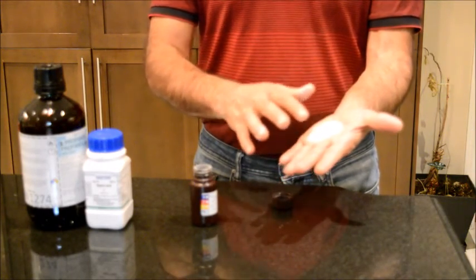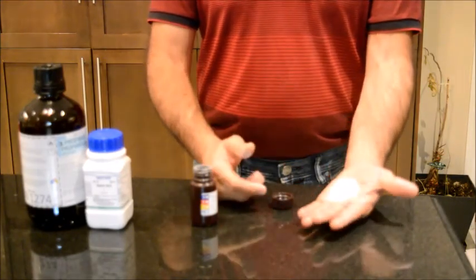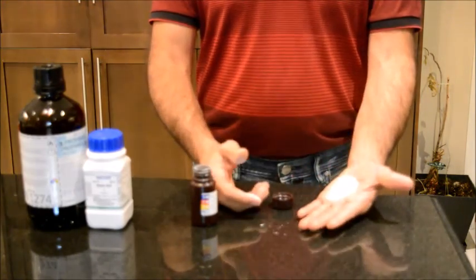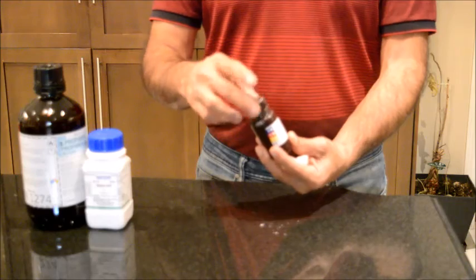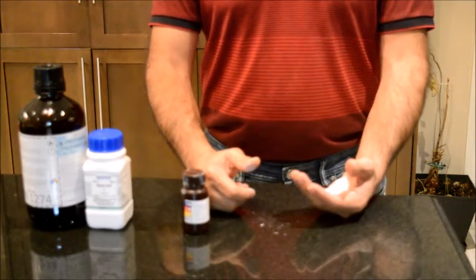I don't recommend you putting so much material on your hand. They are not toxic, but still you better avoid putting too many chemicals on yourself or exposing yourself to too many chemicals. I'm definitely going to wash my hand. So I'm going to go back to my PC, and I will continue this video by showing you some slides.